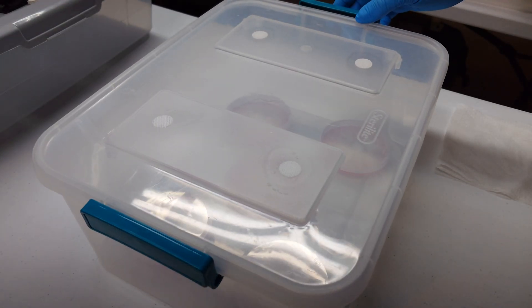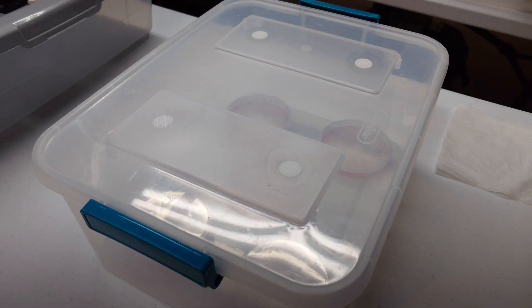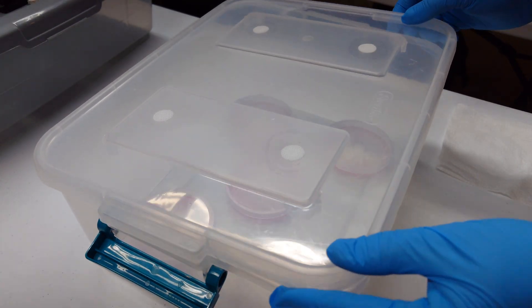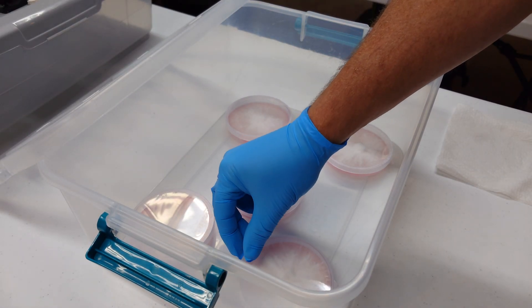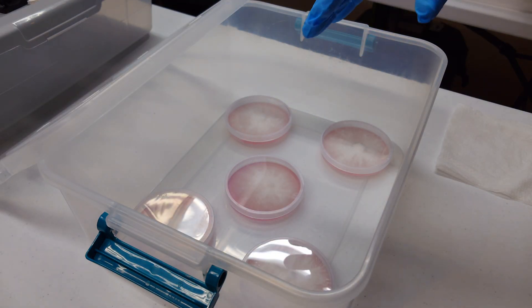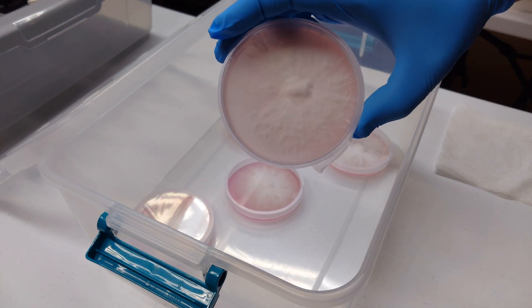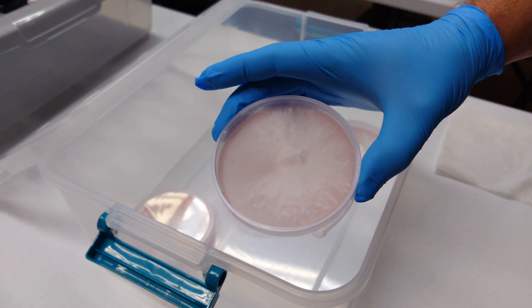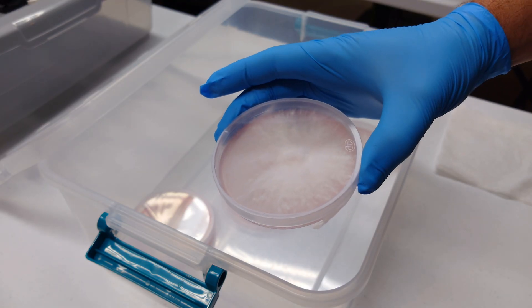We are down in the mushroom lab and I'm gonna show you what we've got going on. These are first-gen plates — I took one of those big baseball bat-sized king oysters from the Asian market and did a simple tissue clone on five petri plates. It's about a week and a half of growth and we have all clean, beautiful plates. We're using pre-poured plates from Micropose.com — an affiliate company of ours. We have really fast, vigorous mycelial growth. You can use promo code RENEGADE at checkout to save 10% and it does support the channel.